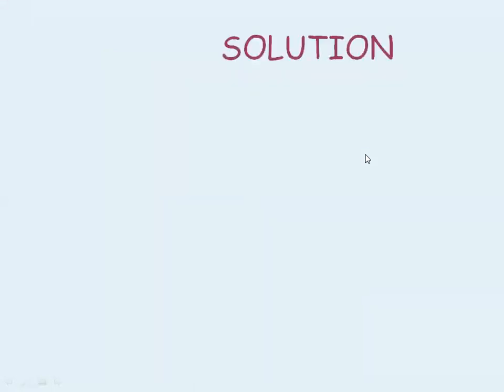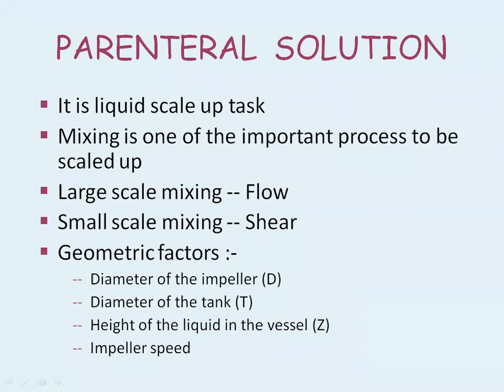Now we will go with the parenteral preparations, parenteral formulation for the scale up. Parenteral means sterile dosage form. It is free from pyrogen, free from foreign materials, insoluble solid material, visible particles.